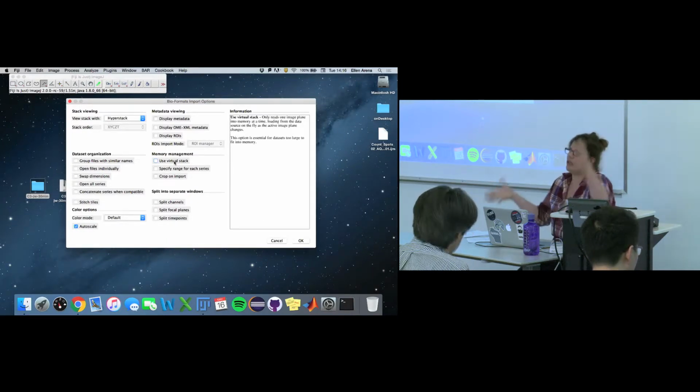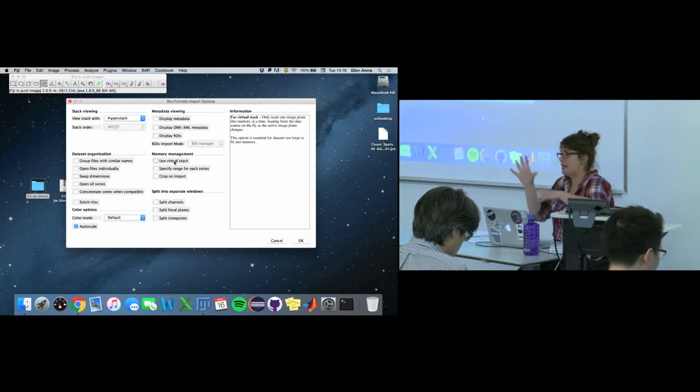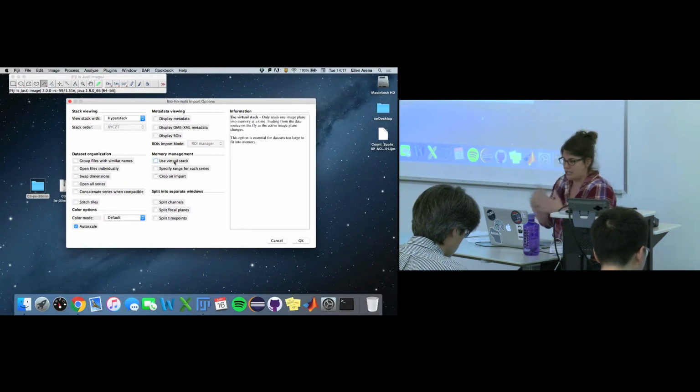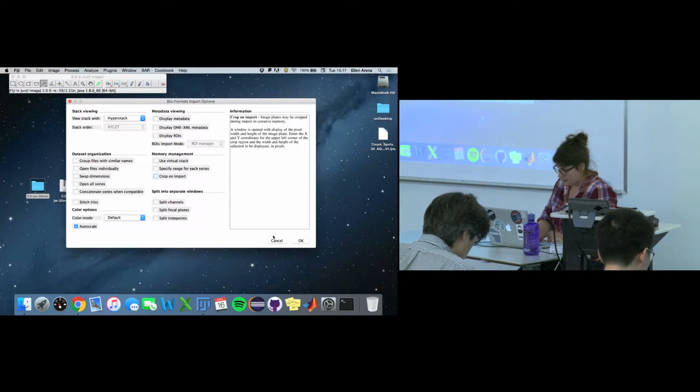So if you have a huge confocal stack of images and you move to like slice 25 and you manipulate that image a bit, like you adjust brightness and contrast or whatever, and then you move to the next slice, it's going to revert to the original view. Those changes that you made aren't saved, because it's just a read-only view into it, but it allows you to quickly see your data. You can also crop images on import if you want, if you're working with large images.